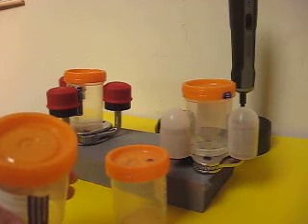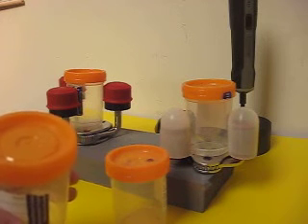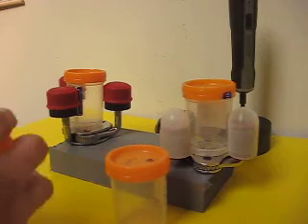This cap has a 101, two and a half or two and one-eighth inch diameter cap.